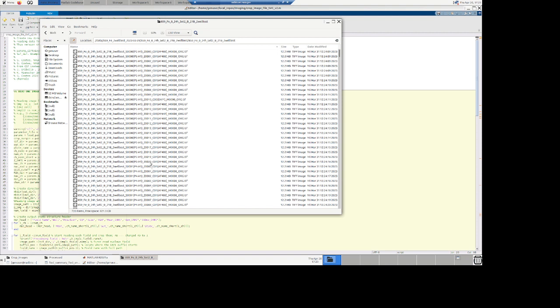So it's 21 slices. And for the 3 other channels, DAPI, which is nucleus, which is blue, and then 594 and 647, those are different kinds of red, from visible red to far red, where it's hard to see with your eyes. They took the middle section for that. So they took section number 10. It's to save space, and those channels were taken to look at the intensity inside the cell and outside the cell.